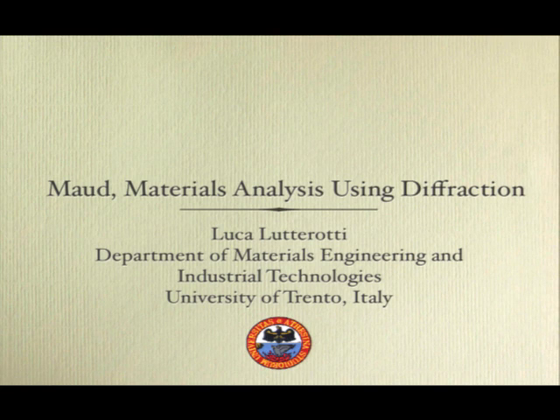It's a little bit difficult to just show everything. So what I try to show here now is just a general introduction to the program, okay? I will show you something I didn't show before on thin film, because we will not go through a tutorial on thin film, so you will just see what it does. And then we will go through an example in which we deal with size strain, so crystallite size, microstrain.